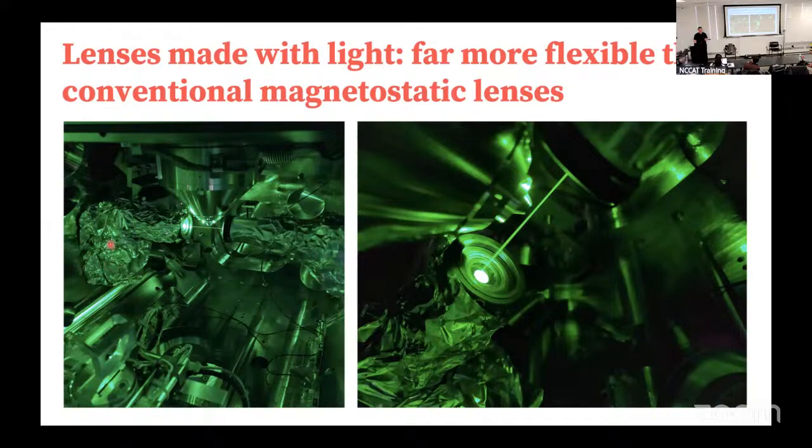So you have a mirror here, and then you have a final lens. And then you're focusing that laser beam right down to a very fine point directly under the pole piece. So this pole piece is where the electrons are coming off. And then you're passing the photons out through the other side, and then they go down a periscope and onto some photon dump outside the microscope. So you really are going in, hitting the electron beam, and then coming out again.